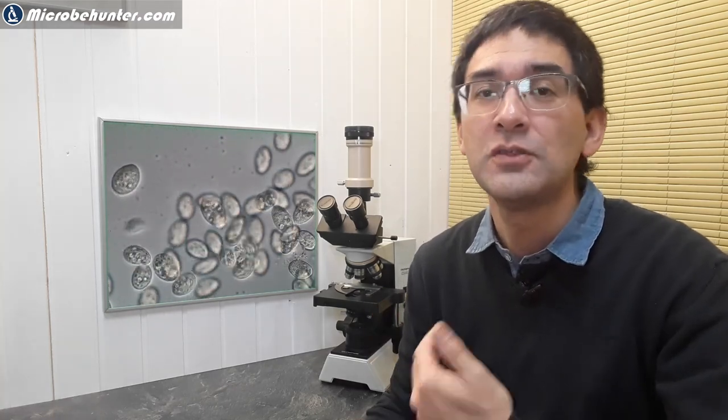Concerning the question of how many megapixels should your microscope camera have, I can give you recommendations. First of all, I'm going to be quite frank with you: anything above five megapixels is wasted. The reason is because the microscope itself is not able to deliver the resolution.